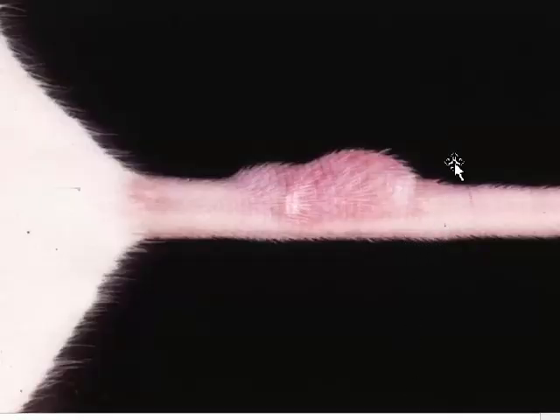Here's a very special strain of mouse, the FVB mouse, which is used for a number of things, including a lot of transgenics because it has very large pronuclei in the eggs. But one of the things that it does have is a fair number of tumors of the neural crest, which appear either on the tail or occasionally on the pinna of the ear.